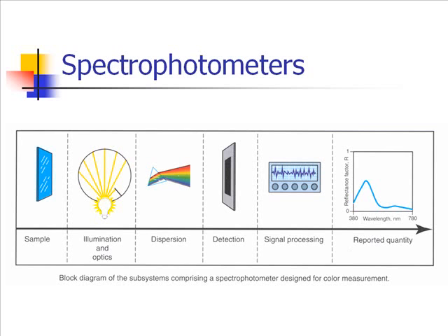And black is the color they work with because it absorbs the most energy. There are companies that make IR reflecting blacks or IR reflecting pigments, so they're interested not only in 780 but much higher wavelengths to see what it reflects. So they have special spectrophotometers that measure that. There are some applications for that, but they're special applications.